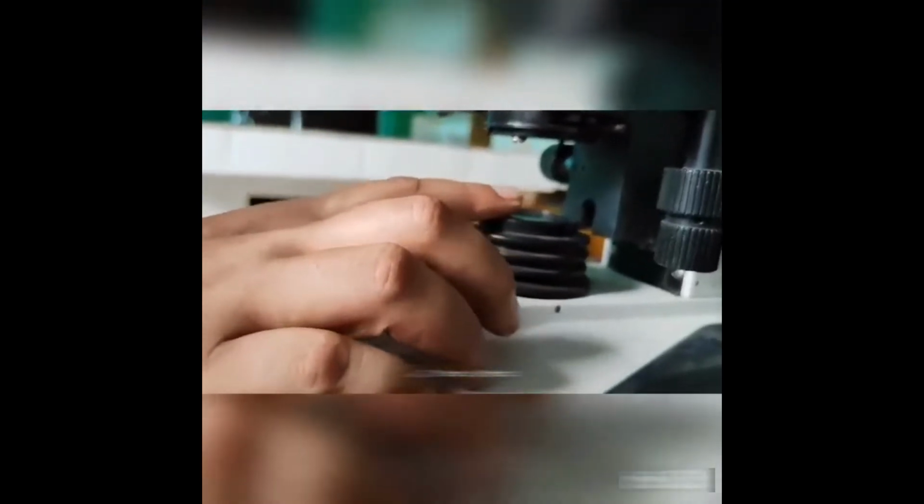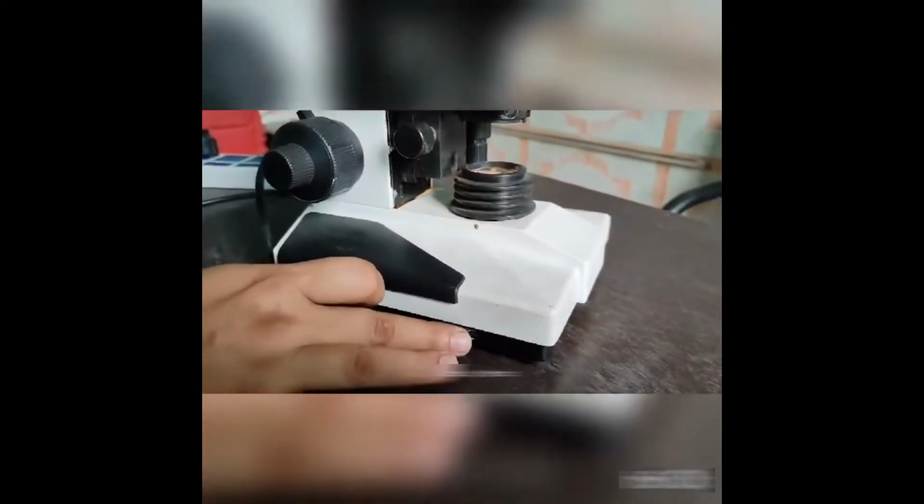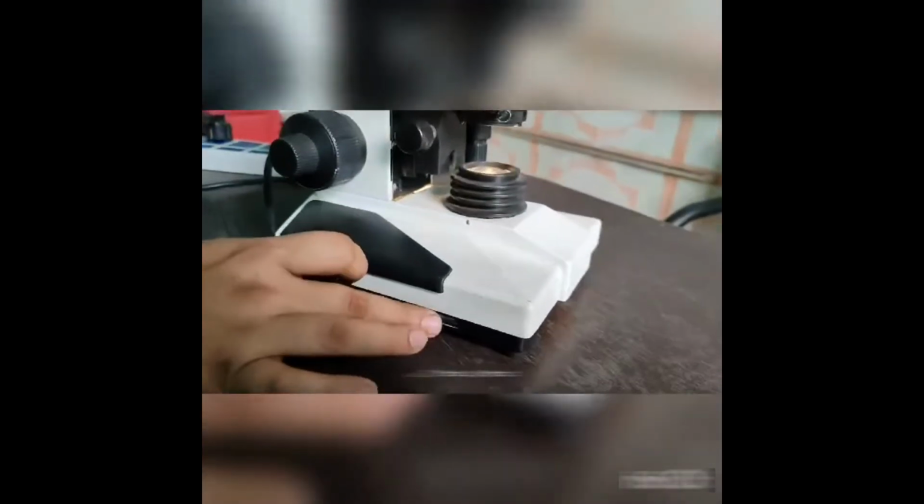And then this is the condenser, and this is the mirror, and this is the diaphragm. Oh students, this is the light source, and this is the power adjustment. You can increase or decrease the light according to your necessity. So these are all the parts of a compound microscope.